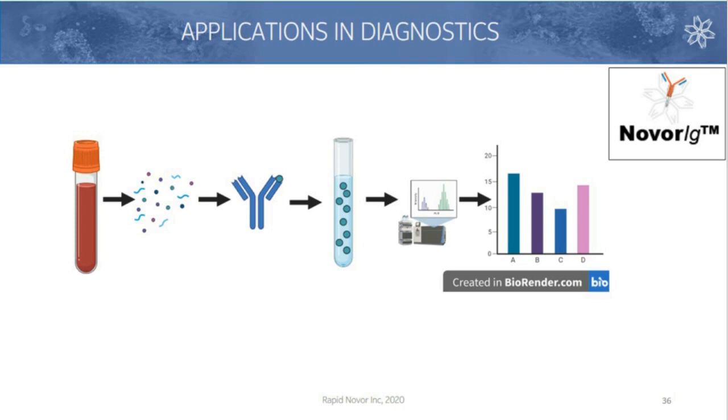And of course, we can then use mass spec to actually do a relative quantitation of that particular analyte. This is where the value of the technology really comes in. As compared to something like an optical-based method, we can strictly analyze a specific analyte of interest and then perform a relative quantitation over time.